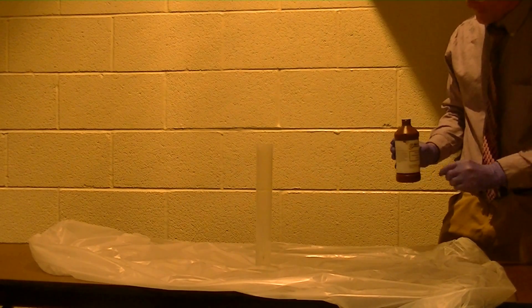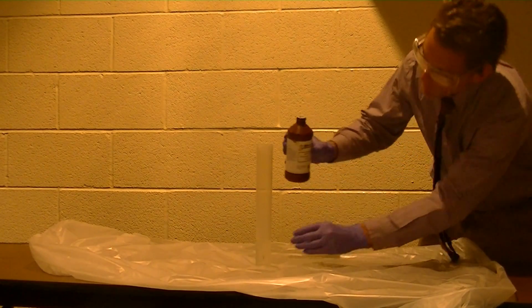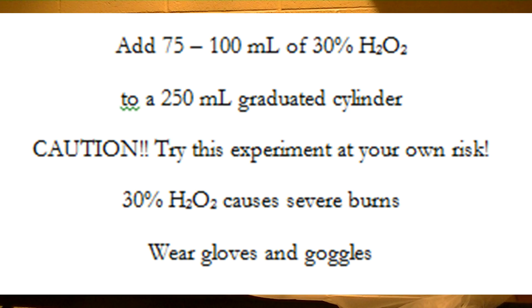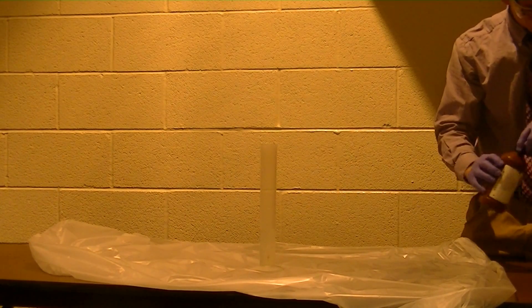Alright, elephant toothpaste reaction. I'm going to add 100 mils of 30% hydrogen peroxide to this graduated cylinder. I'm just sort of topping it off here. That's about 90 mils — that's fine. 90 mils of 30% hydrogen peroxide.